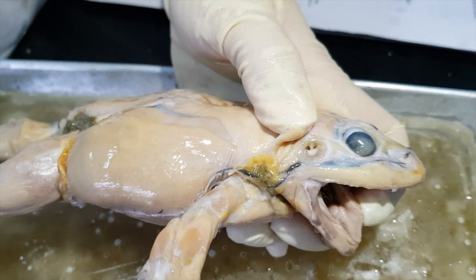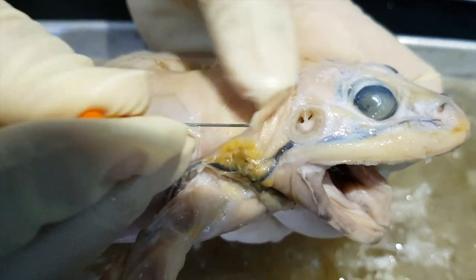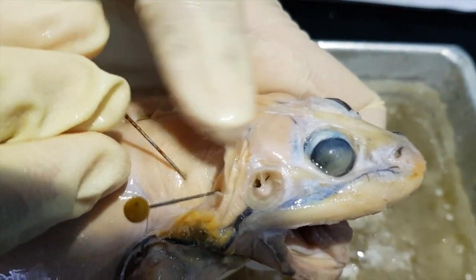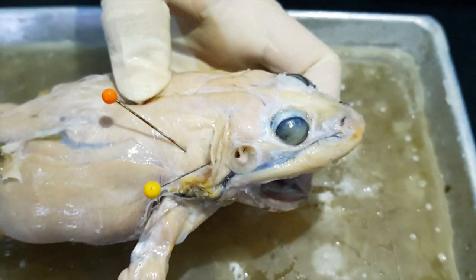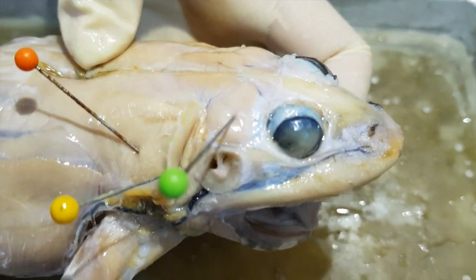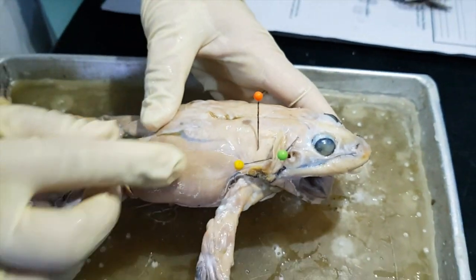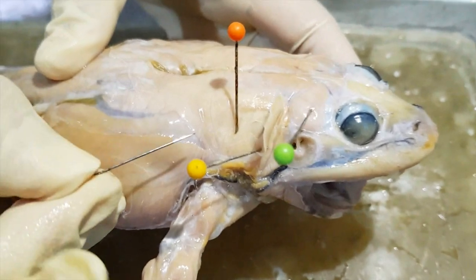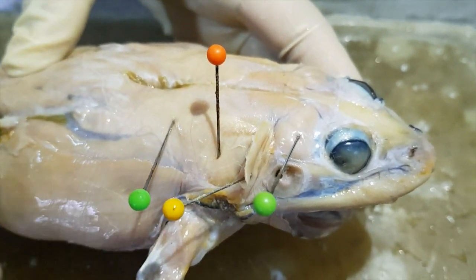So this is the depressor mandibularis, and this one at the bottom is the dorsalis scapula. The other one here on the top is the temporalis. Then as you go downward, caudal, this one is the longissimus dorsi.